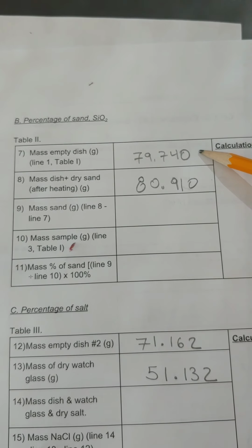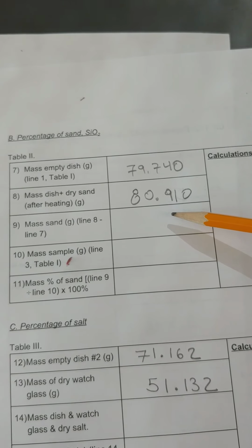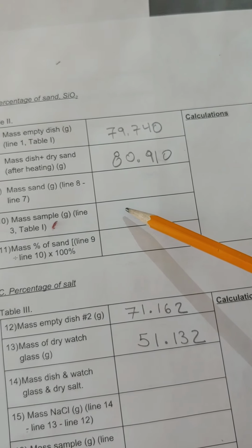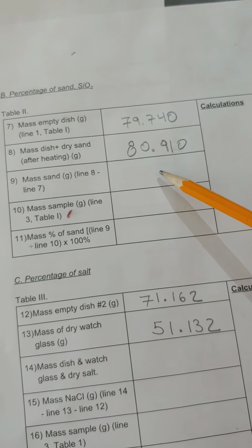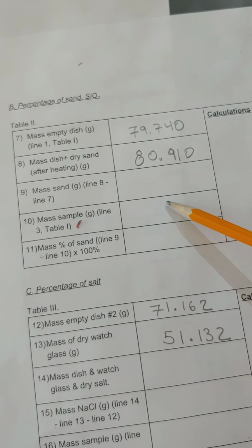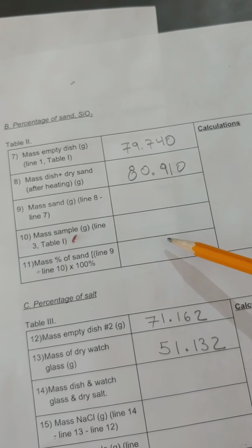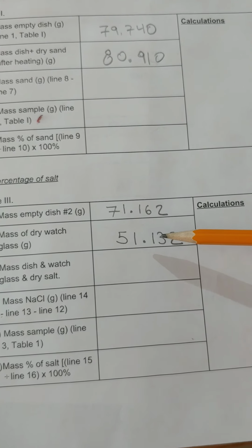So subtract line 7 from line 8, and that'll give us the mass of the sand. The mass of our sample, which we had from line 3 on table 1, that should be the same, and then the number 9 divided by the value here in line 10, multiplied by 100%, will give us our percentage of sand. So we'll go check to see how our salt is doing.